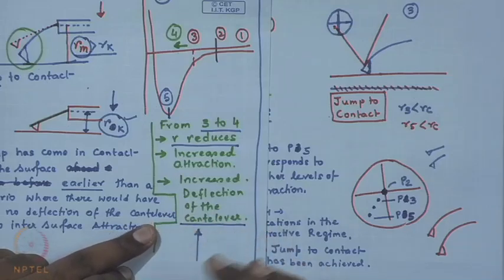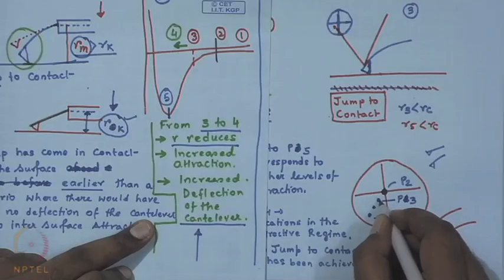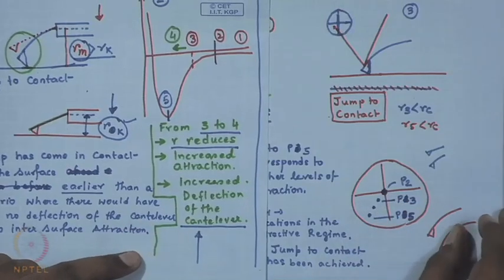What we did not write then and what we understand now, is that this also leads to higher level of deviation of the laser spot on the PSPD from its central point. So, higher is the level of interaction or level of deflection on the cantilever, higher will be the extent by which the laser spot shifts from the center of the QPD or PSPD.